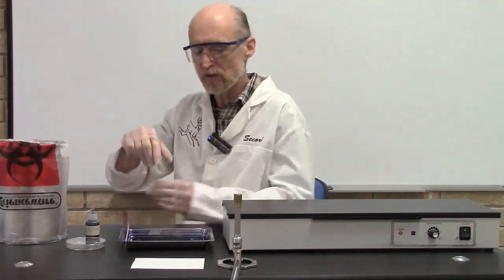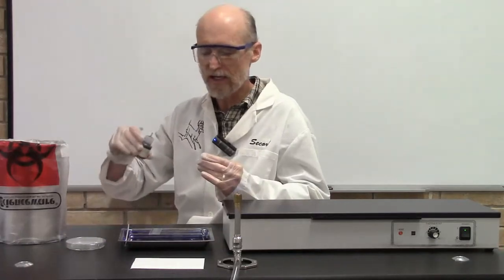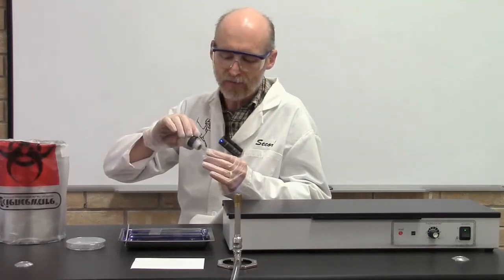First, what you want to do is take one of your slides and put a small drop of nigrosin near one end. Don't get it on your fingers, so I go about probably a half inch from the end of the slide, and I put a little drop of nigrosin.